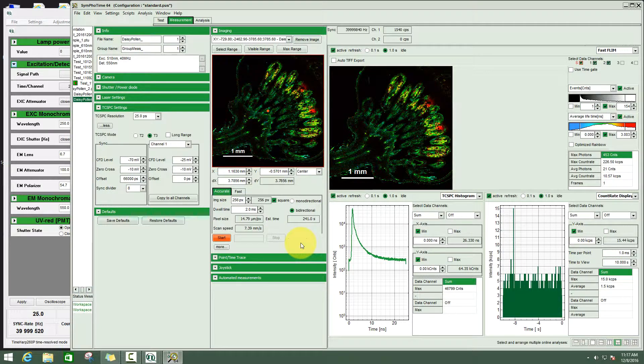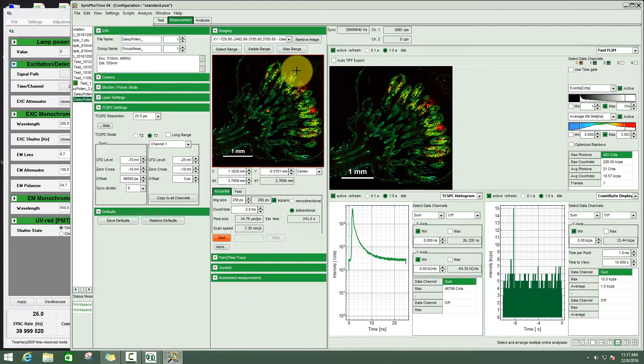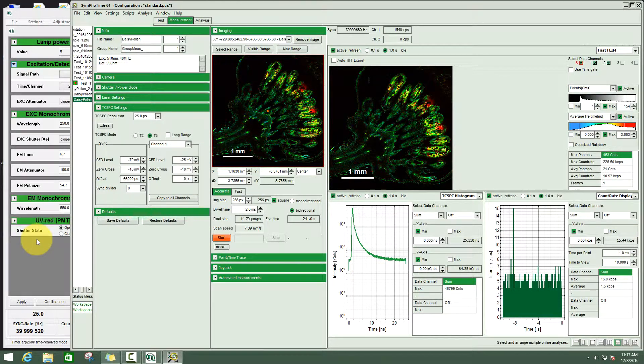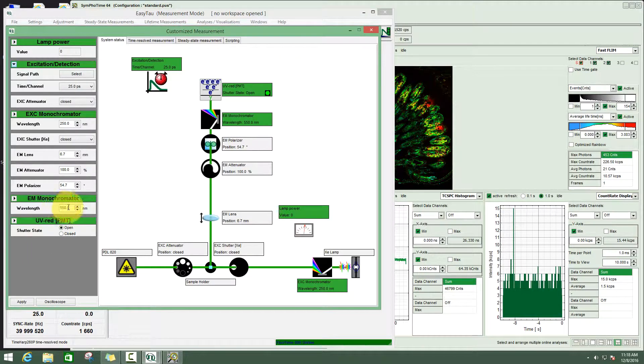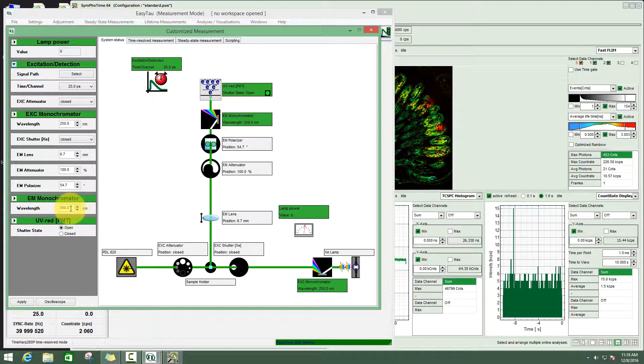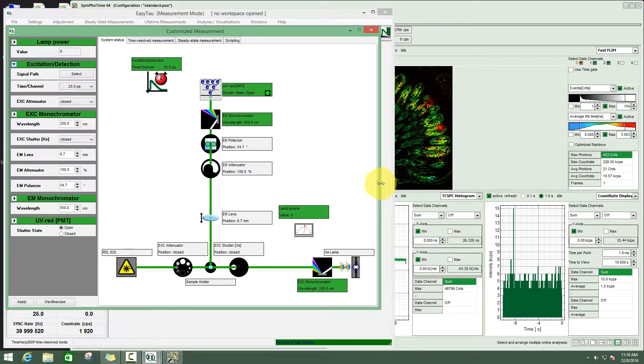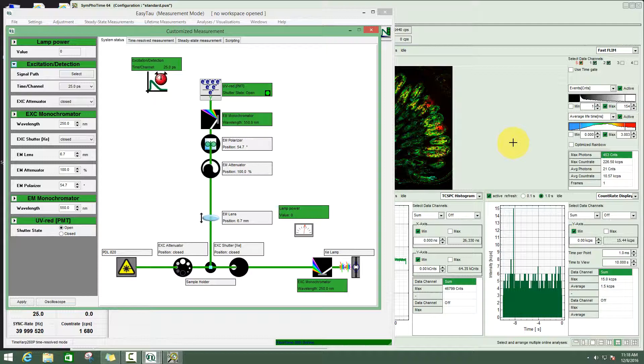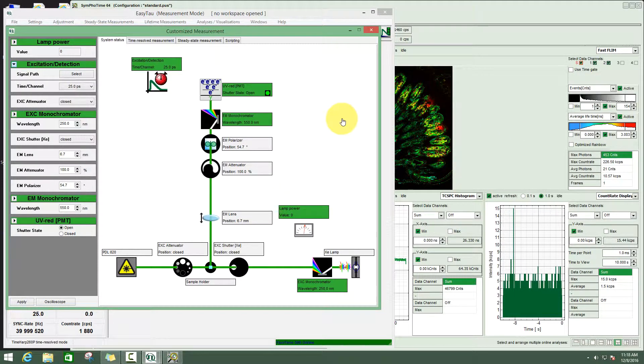Now we have several possibilities to continue. We can, for example, take the same area, change here the grating of the emission monochromator, and take another image with different emission wavelengths and get a series of images acquired at different emission wavelengths. Some kind of time resolved emission imaging.